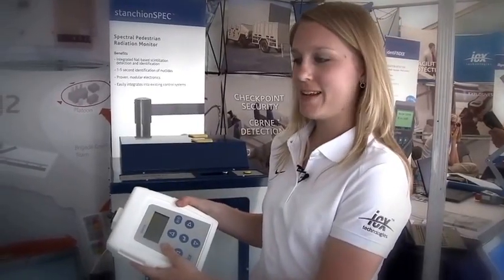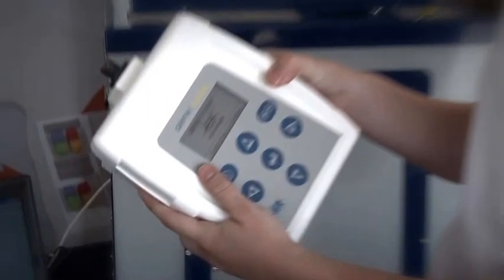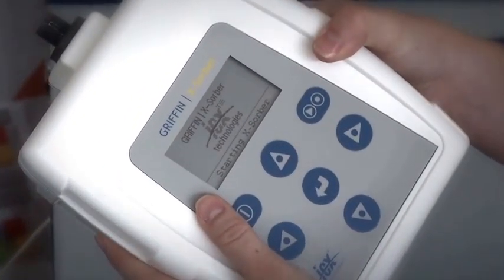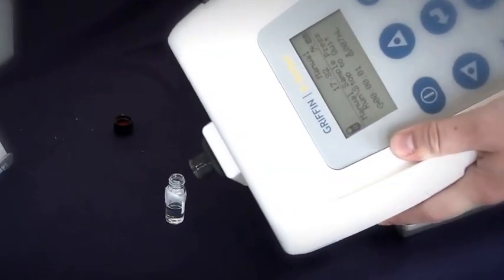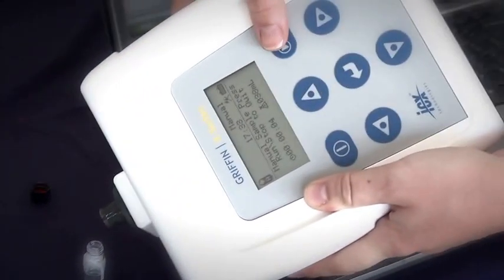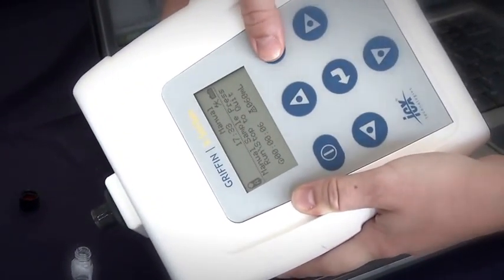Today we're just going to do a volume based sample. I'm going to press power and it's going to start up and tune itself automatically. We're going to collect 60 milliliters of this clear unknown sample. I've pressed start and it's sampling. Here are the milliliters, here is the time, and we now have 60 milliliters, so I press stop.